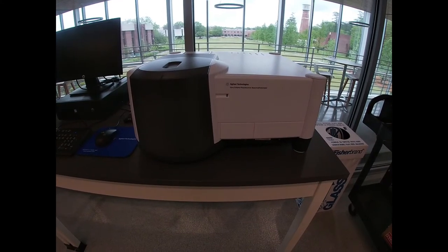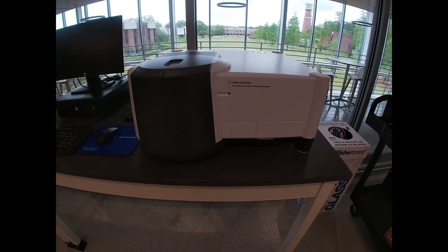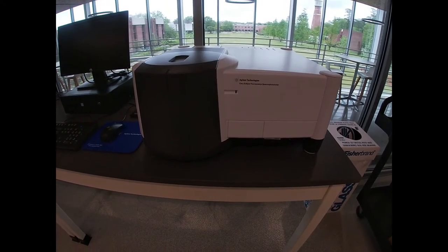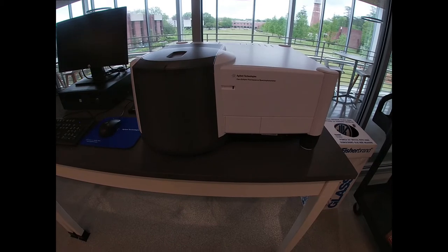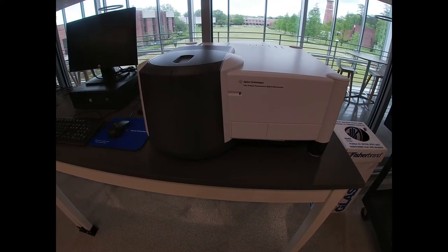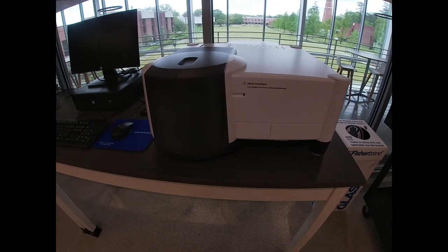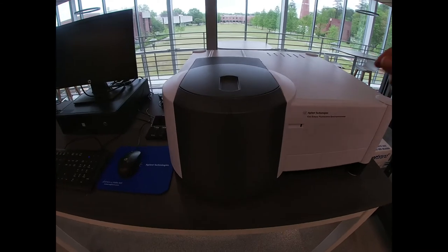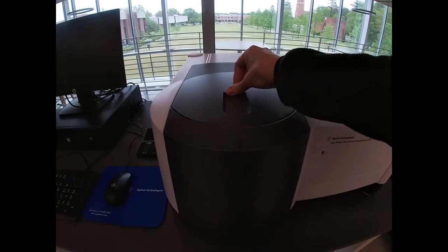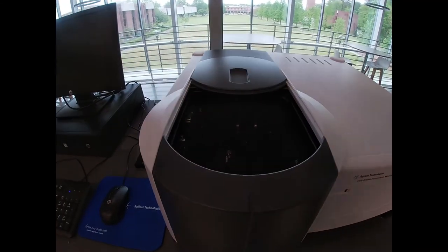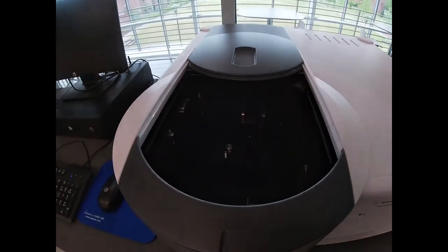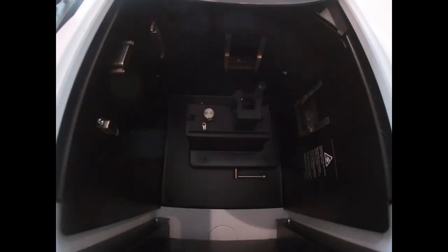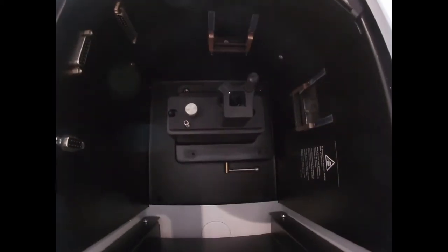This is our Agilent Eclipse spectrofluorimeter, a fluorescence spectrometer. Although it is relatively similar to a UV-Vis spectrophotometer, it has unique features.